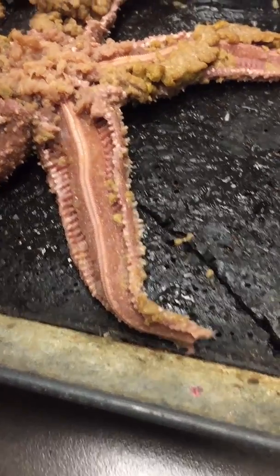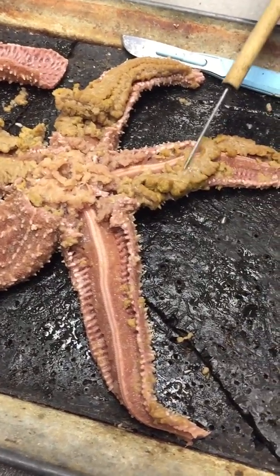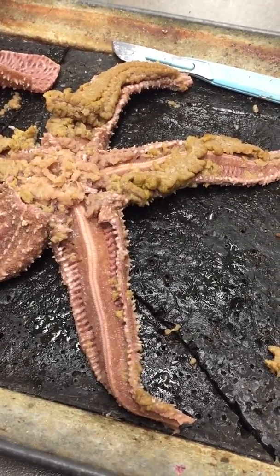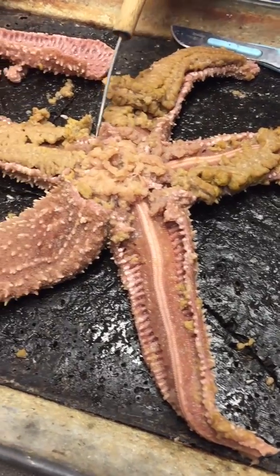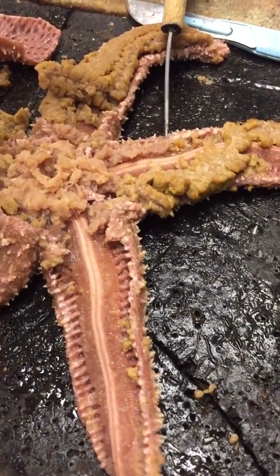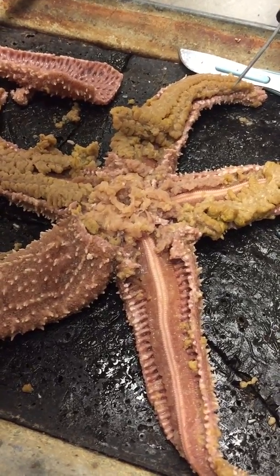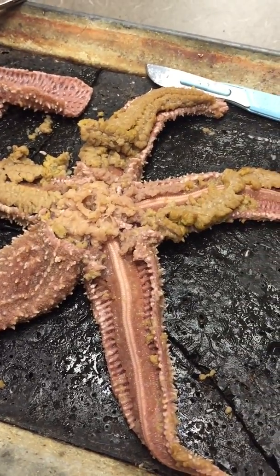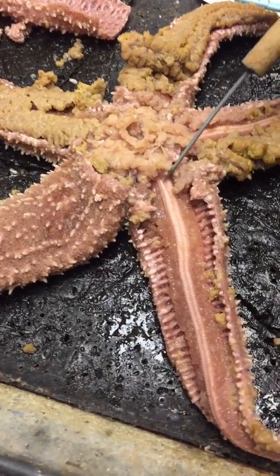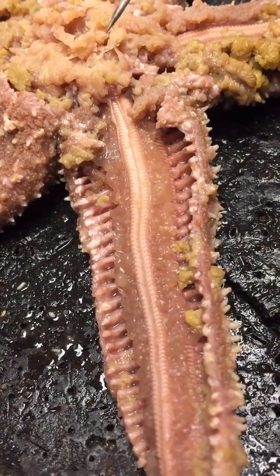The stomach is this. The pyloric cecum is the squishy yellow stuff, which is also the liver. The gonads are close to the stomach and they radiate out — they're short and described like grapes. The intestines you can't see. The gastric ligaments are this clear tissue.